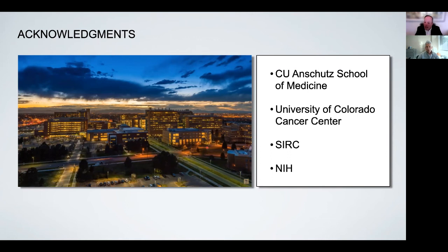Cryo-electron tomography, on the other hand, also relies on different views of an object, but instead of collecting images of many identical objects, you collect many images of one single object, for example, a cell. So it's called tomography because instead of taking pictures of 10,000 particles, you take pictures of a cell in different orientations by tilting the specimen in the microscope. You're imaging a single object by taking tilts of that object and collecting images in different orientations. Now, the differences between the two approaches explain their capabilities.